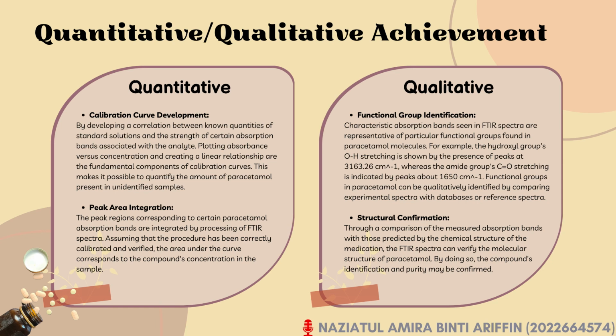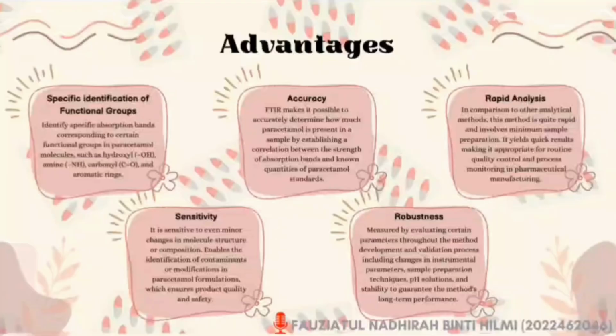For structural confirmation, through the comparison of the measured absorption bands with those predicted by the chemical structure of the medication, the FTIR spectra can verify the molecular structure of the paracetamol. By doing so, the compound's identification and purity may be confirmed. The next part is the advantages of FTIR analysis of paracetamol.